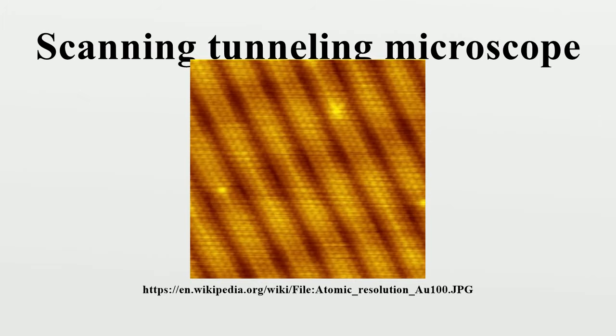Procedure. First, a voltage bias is applied and the tip is brought close to the sample by coarse sample-to-tip control, which is turned off when the tip and sample are sufficiently close. At close range, fine control of the tip in all three dimensions when near the sample is typically piezoelectric, maintaining tip-sample separation W typically in the 4 to 7 Å range, which is the equilibrium position between attractive and repulsive interactions.